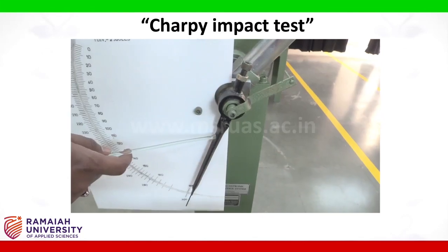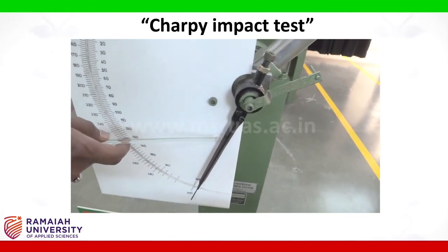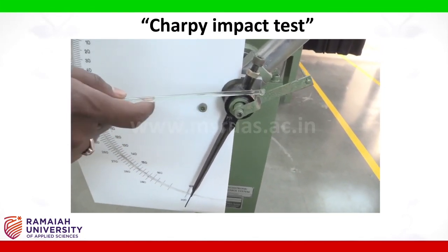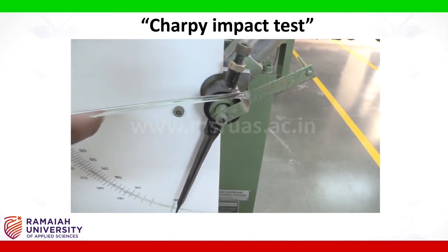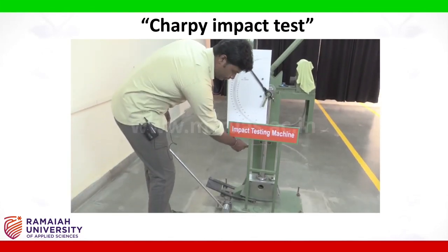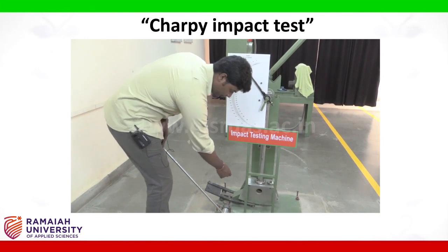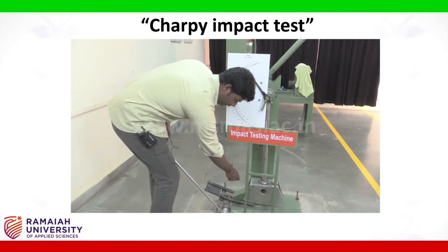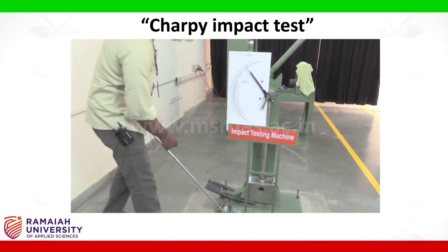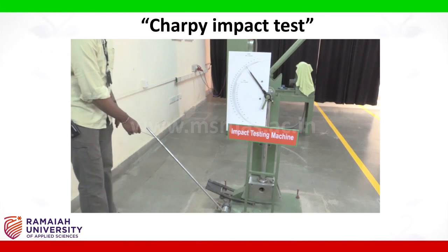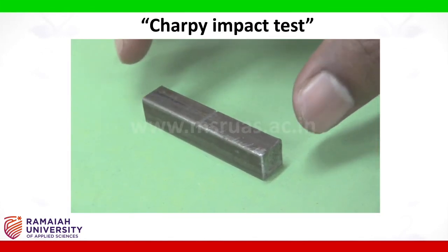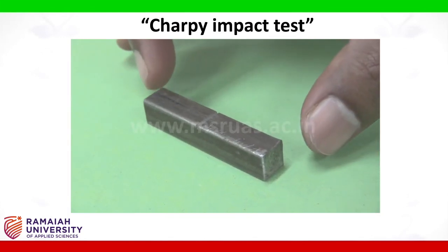This is the dial pointer, which is used to take the reading. This is the pointer carrier. This is the pendulum tube and pendulum hammer. And this is the brake, used to stop the pendulum.